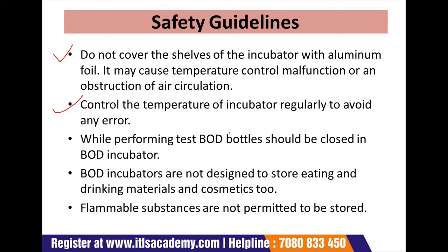Second, check the temperature of the incubator regularly to avoid any error. Third, while performing the test, BOD bottles should be closed in the BOD incubator. Next, BOD incubators are not designed to store eating and drinking material and cosmetic items. And the last one is that flammable substances are not permitted to be stored.